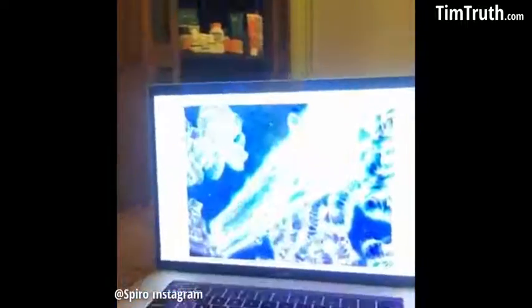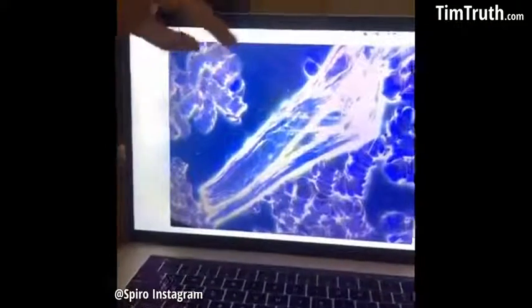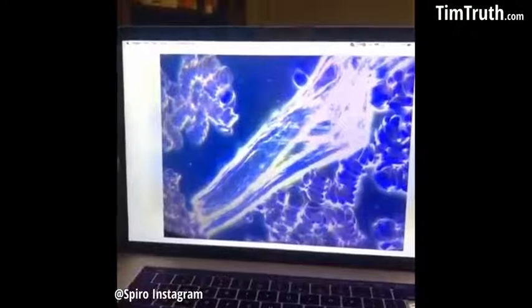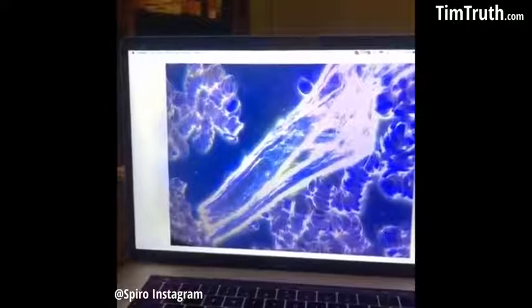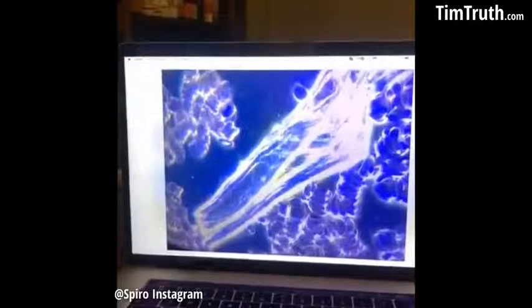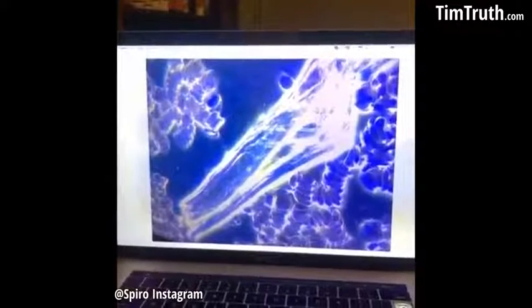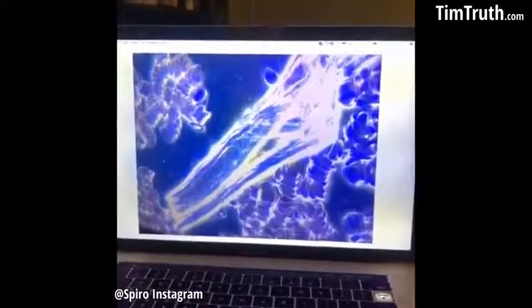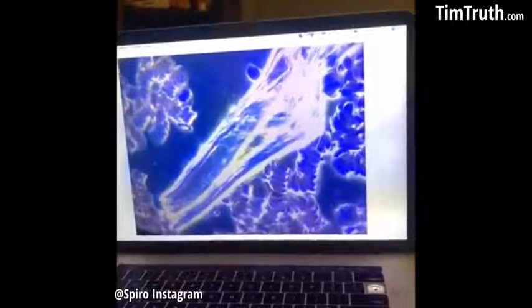What we see here is that the red blood cells are all stuck on each other, like pancakes we could say. It's a coagulation problem, so they're stuck on each other. And what we also see is this big thing here in the blood, which I cannot explain exactly what it is because I cannot analyze it deeper here with my equipment, but I can assume it's graphene oxide or something. Have you ever seen this before? No. You have never seen this before. No. How many years have you been practicing?